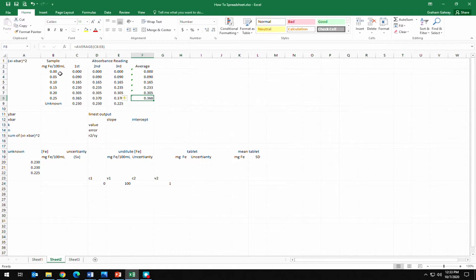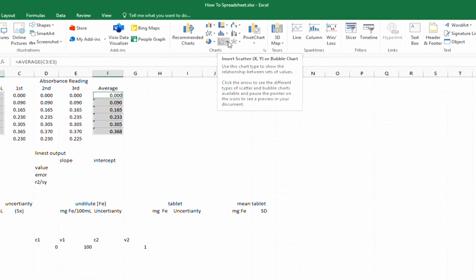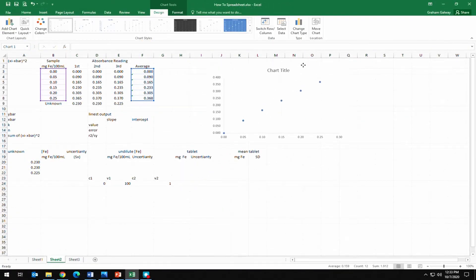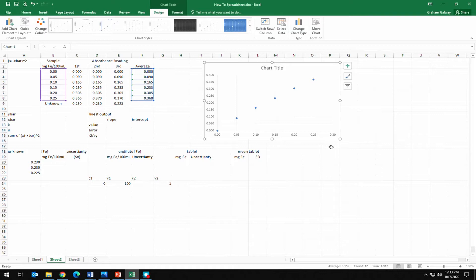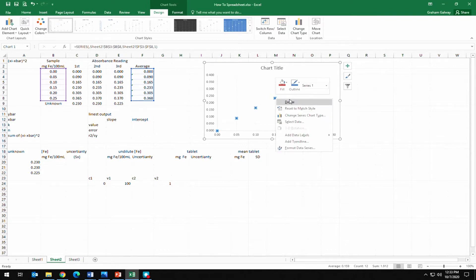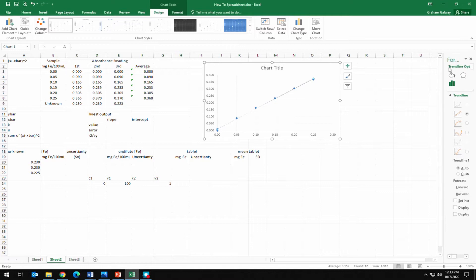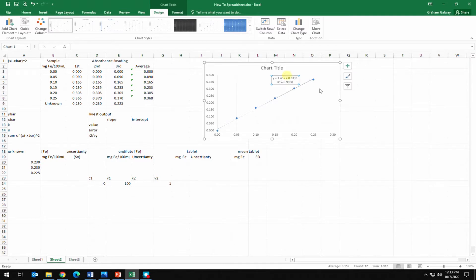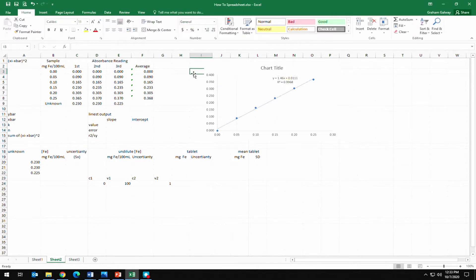We can now select our known x's and known y's, go to Insert, and create a scatter plot. Moving the graph out of the way, we add a linear trend line. We don't want to set the intercept, but we do want to display the equation on the chart and the R-squared value. Now we have our calibration chart with those values shown.